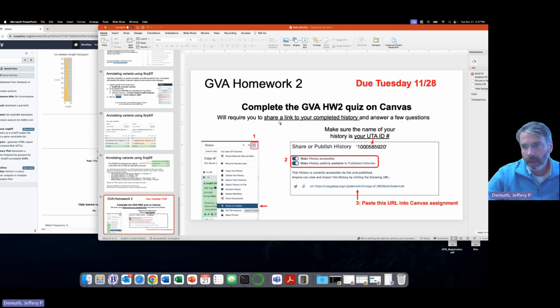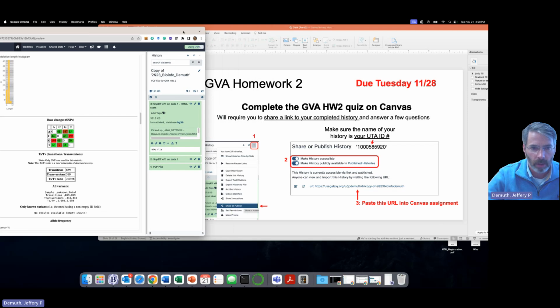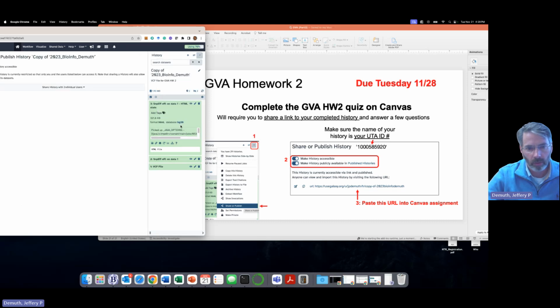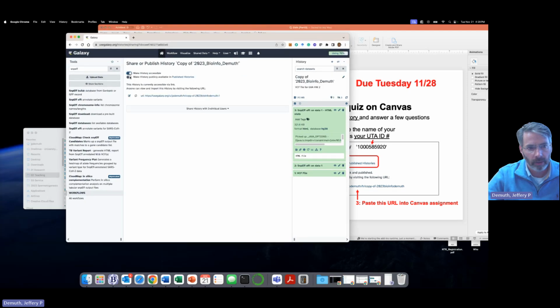Right. So last slide, the homework due Tuesday the 28th is to complete the GVA quiz on Canvas. One part of it is to share your completed history. So the same way I shared the variant call file with you, you're going to have to share your result with me. So you click this little arrow and then come down to share or publish. So that's 1 and 2 on the slide.